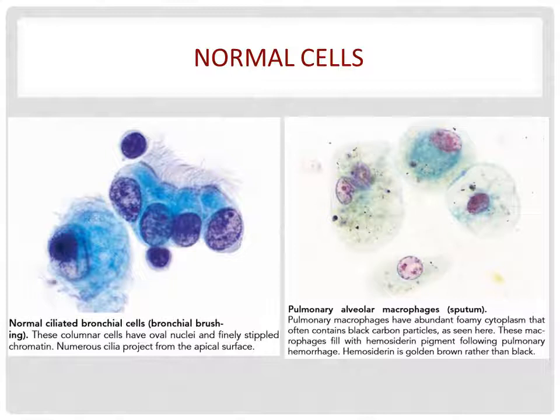Now let's look at the respiratory cell morphology, starting with normal cells. The first image shows normal ciliated bronchial cells from bronchial aspirations. If you look at the cells, they have oval nuclei and numerous cilia at the apical surface. For the right image, it shows pulmonary alveolar macrophages obtained from sputum. These cells have abundant foamy cytoplasm and also contain black carbon particles.